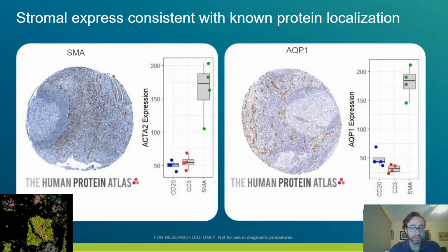And the Human Protein Atlas is a great place to validate any of the findings that you have if you're working on our system. The benefit of using this as a validation source is that it is the functional readout as a post-translational readout, while we are also profiling just RNA species expression.